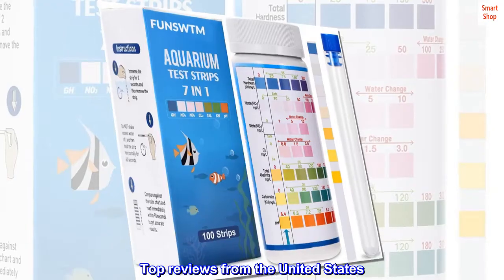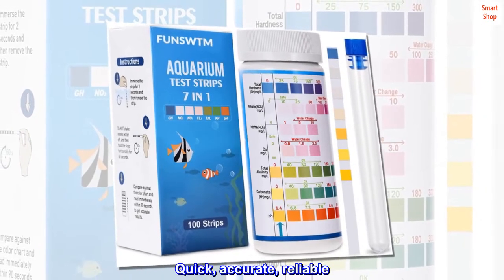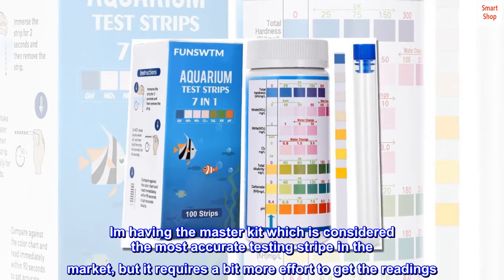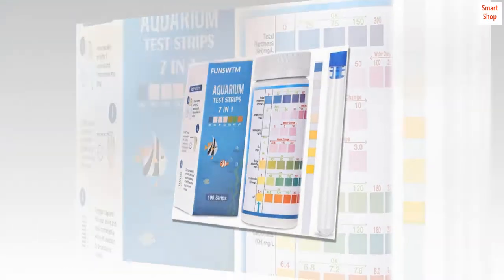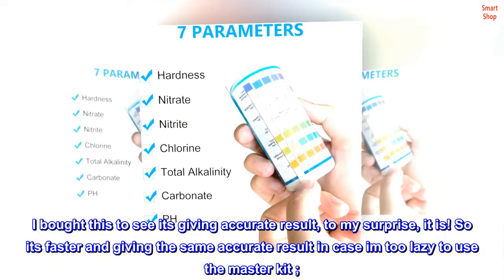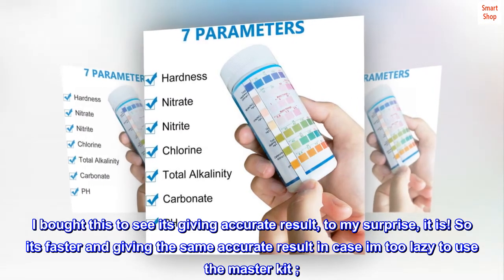Top reviews from the United States. Quick, accurate, reliable. I have the master kit which is considered the most accurate testing strip in the market, but it requires a bit more effort to get the readings. I bought this to see if it gives accurate results — to my surprise, it does. So it's faster and gives the same accurate result for when I'm too lazy to use the master kit.